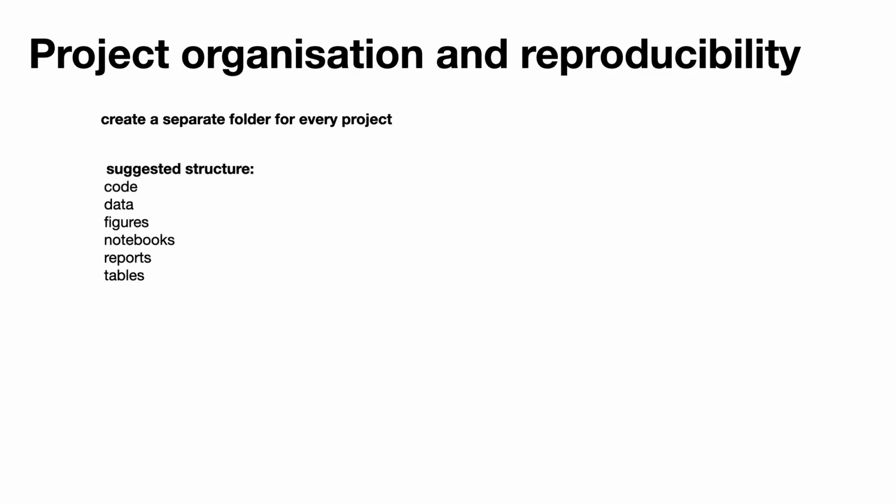Okay, so now you're more or less fit to conduct your own single-cell RNA sequencing data analysis with scanpy. Okay, what now? When you want to have your project organized, I would like to suggest the following structure. You have seen it already in the course material of day 1 and 2, and you probably have wondered, why do I have so many empty folders?